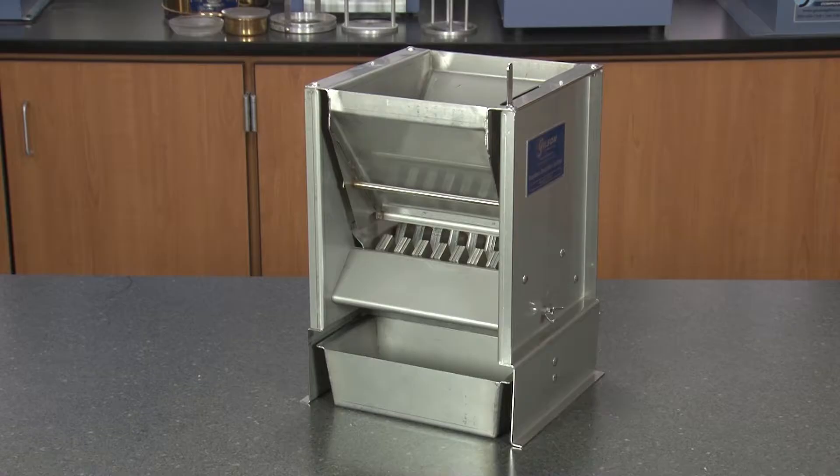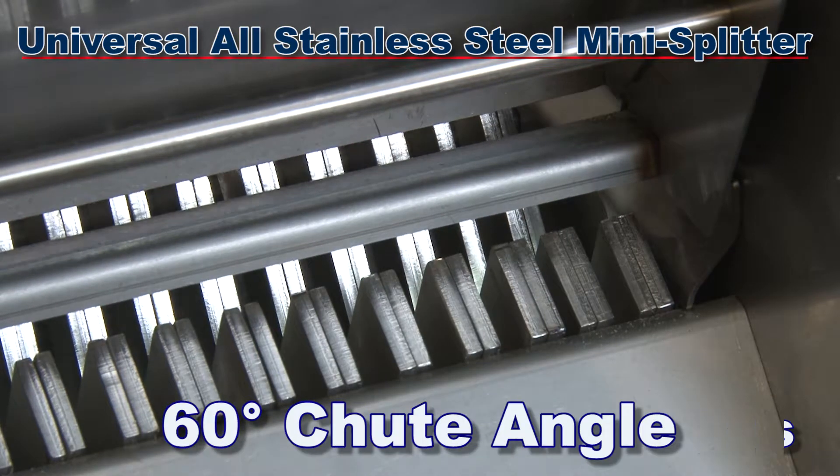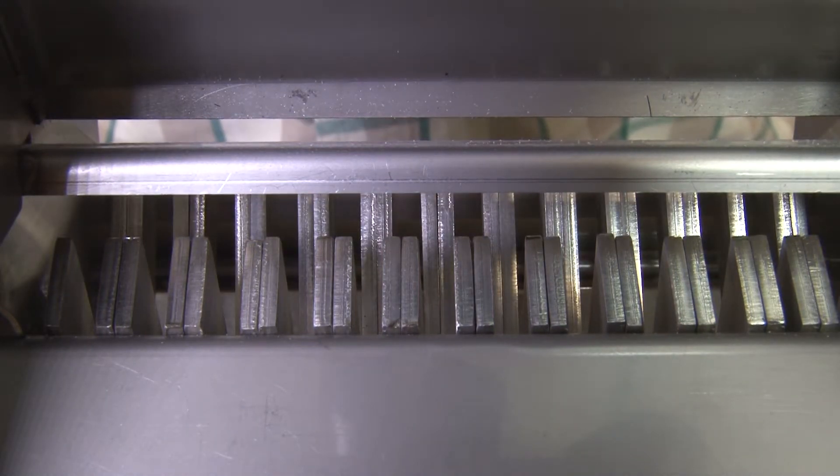This portable benchtop sample splitter features 48 adjustable 1/8 inch wide chute bars and a 60-degree chute angle to quickly and accurately split powders and free-flowing granular materials.